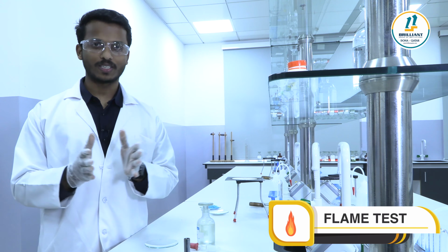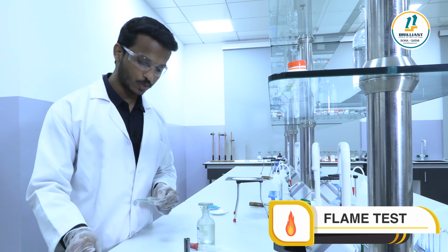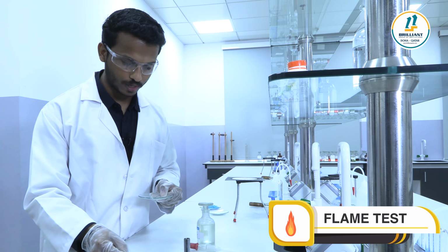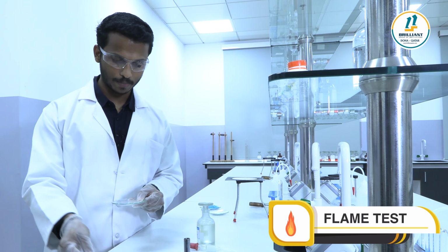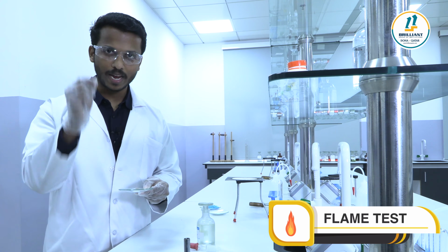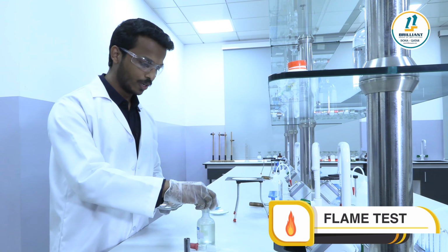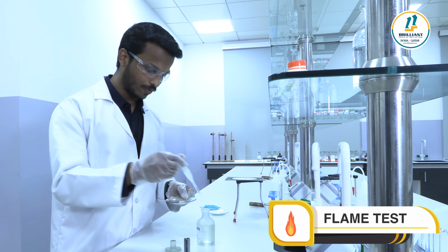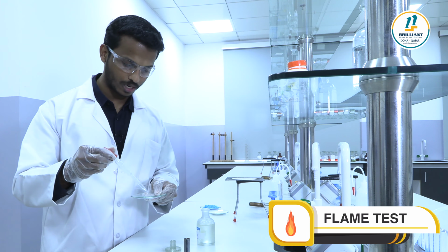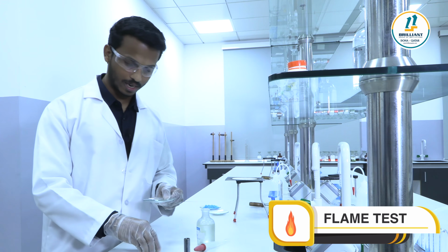Let's do the flame test analysis. The flame test is a very interesting one. So let me take a watch glass. To this watch glass, let me add a pinch of the given salt. Now we have to make a paste of this salt with concentrated HCl. By using a dropper, let me add very few drops, around 1, 2, 3 drops of concentrated HCl.